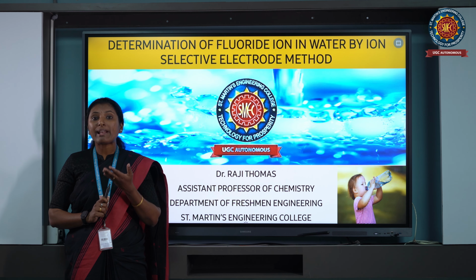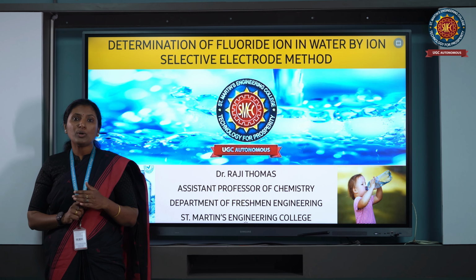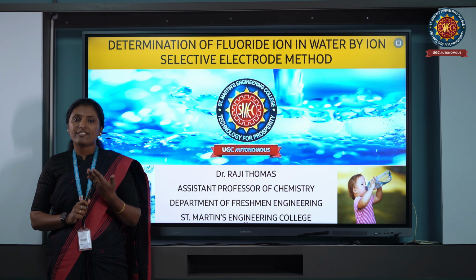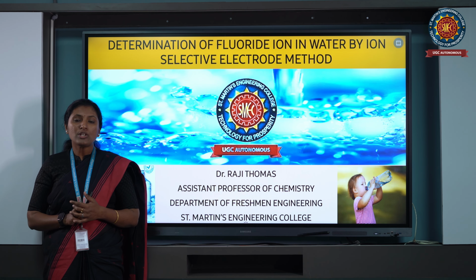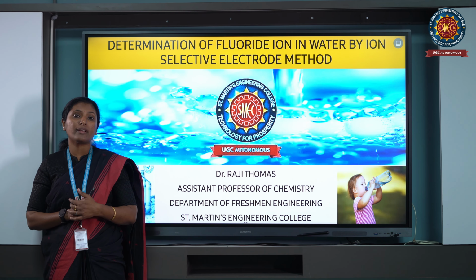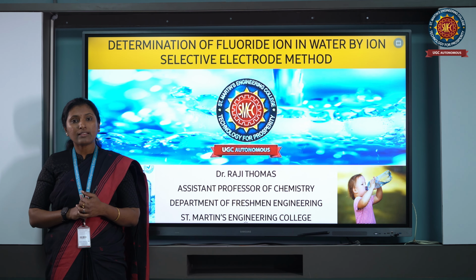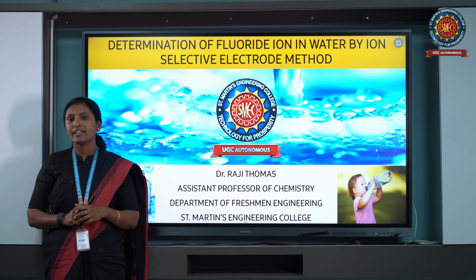Next, you can smell the water, to see whether any foul smell is there or not. After that, you can taste the water, to see whether any taste difference is there or not. So smell, eyes, nose and tongue: you are using these sense organs to analyze the water, its smell, taste and color. These parameters are known as the physical parameters of drinking water.